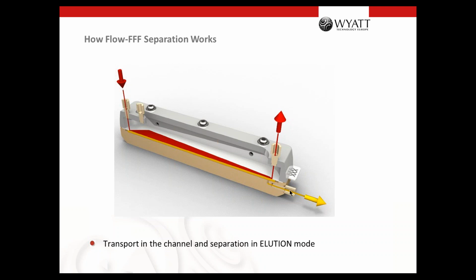Then we have here on this side, at the channel outlet, the detectors. And of course, the detectors produce a lot of back pressure. Usually, that's 5 to 10 bar. And below the membrane, there the crossflow comes out. And the crossflow does not have a back pressure. So that means if we pump liquid in, it would prefer to go out here.